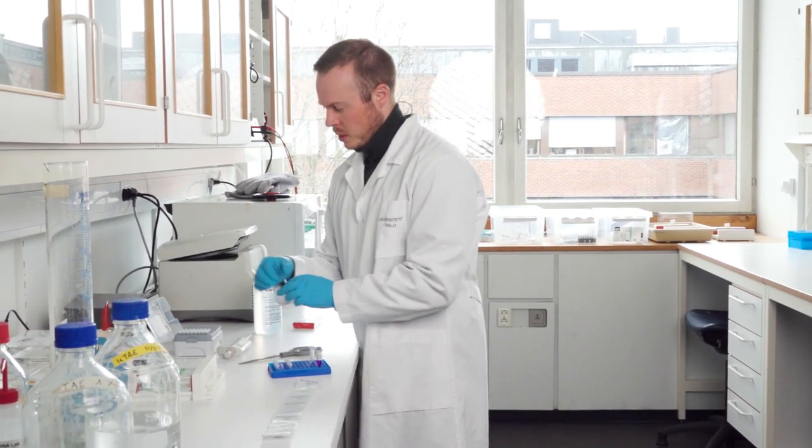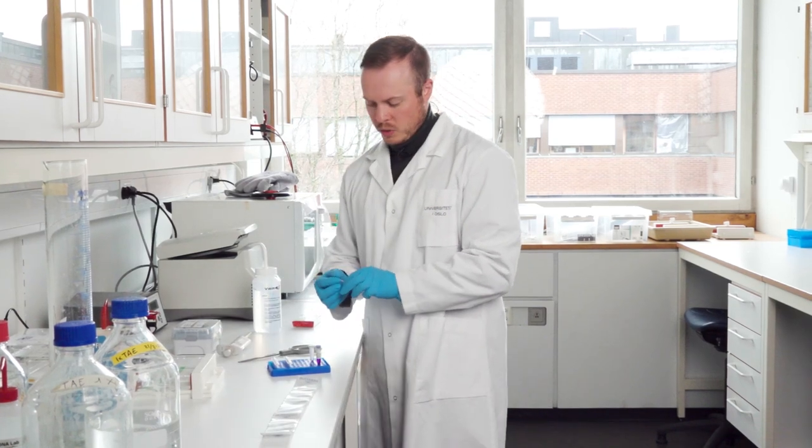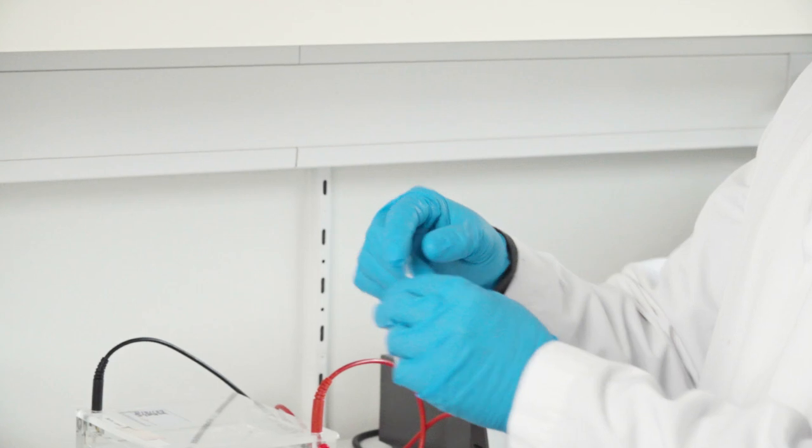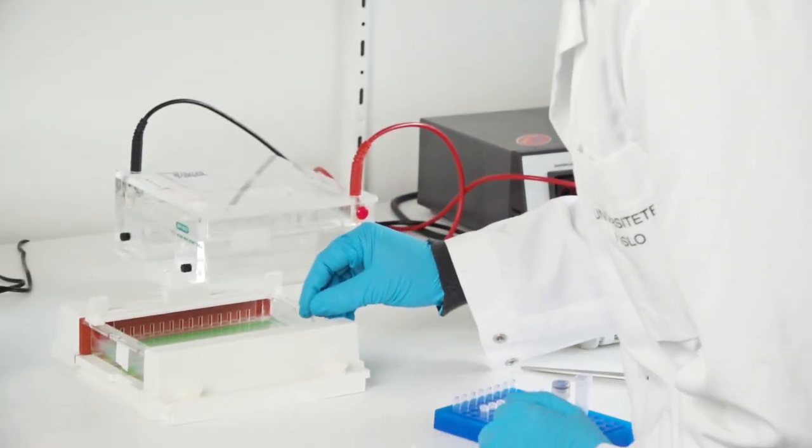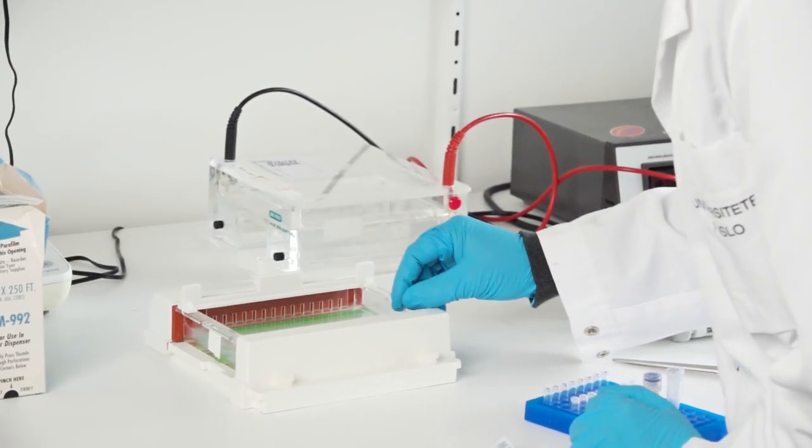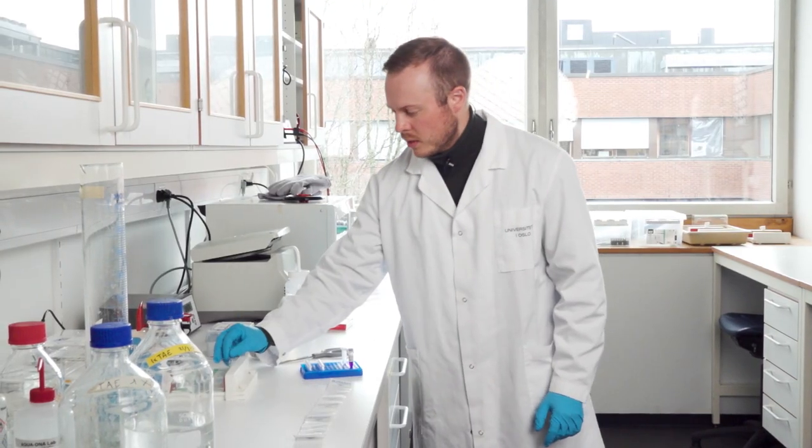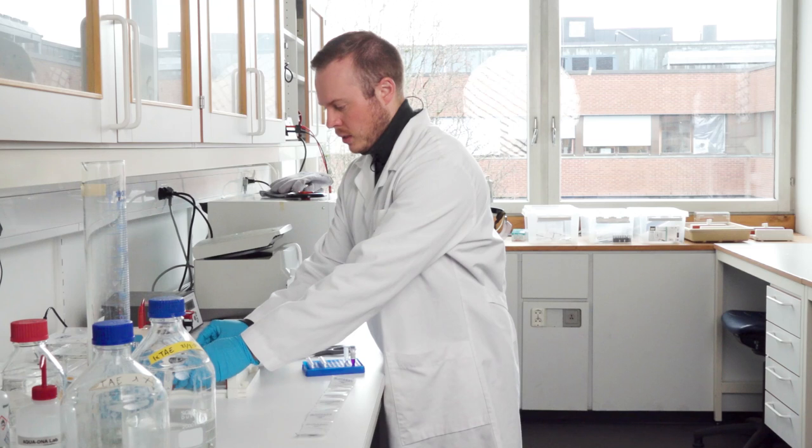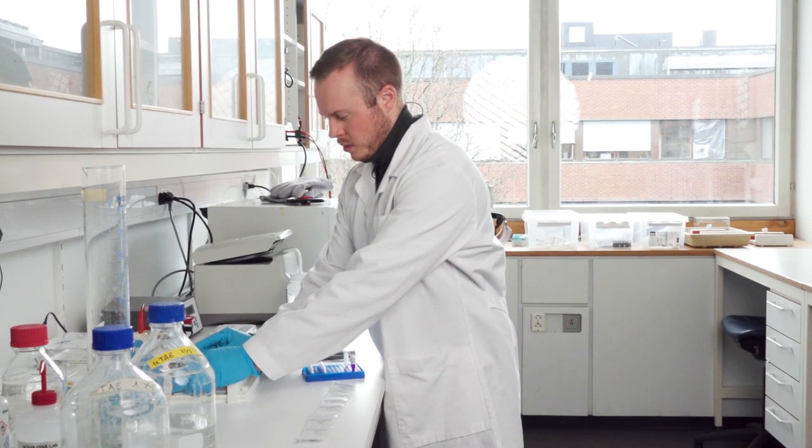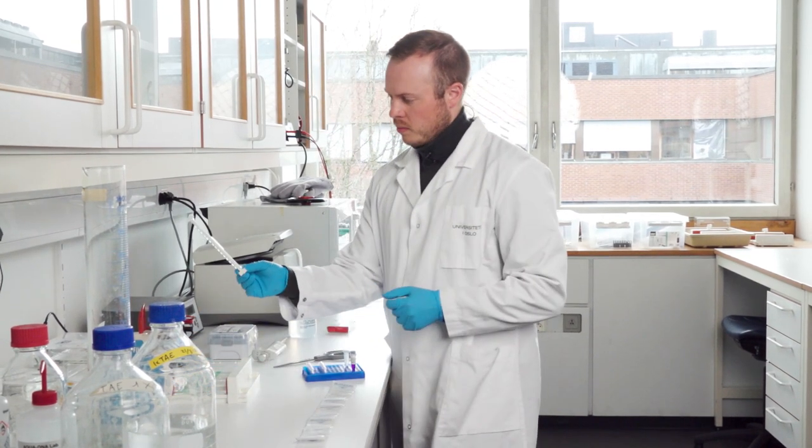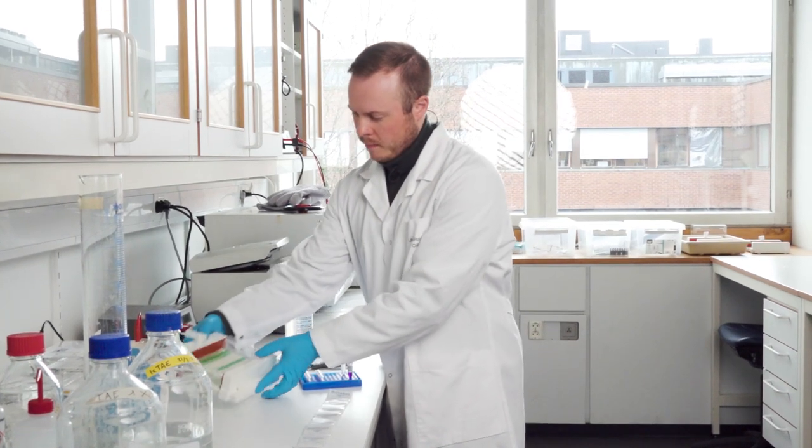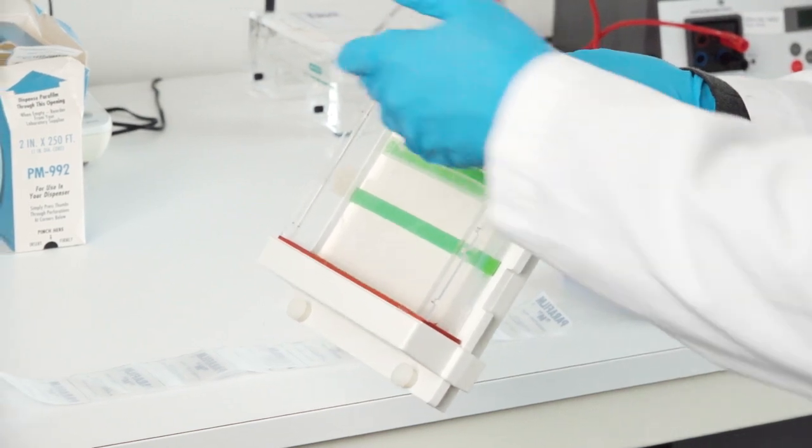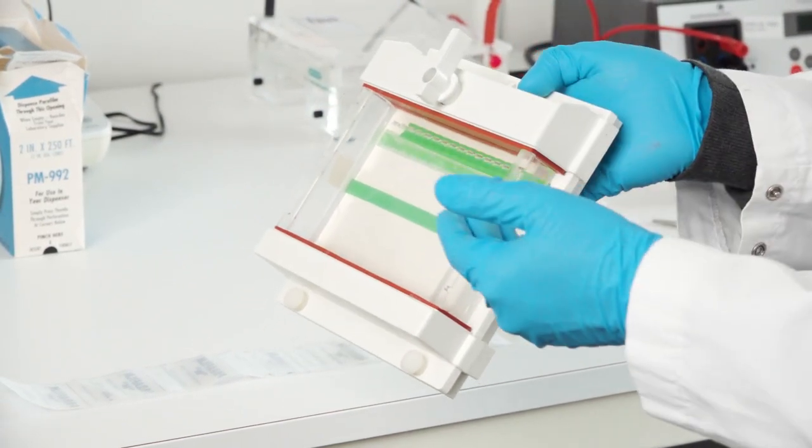Then I take a pipette tip and then I use not the pointy end of the pipette tip but the blunt end of the pipette tip to check the gel. And now I feel that it's hard. It's not a lot of pressure that's needed, just a little bit. Then I can open and take out the teeth from the mold and we now have a very clear row of wells that we can put our samples in.